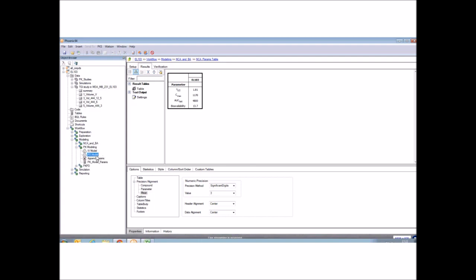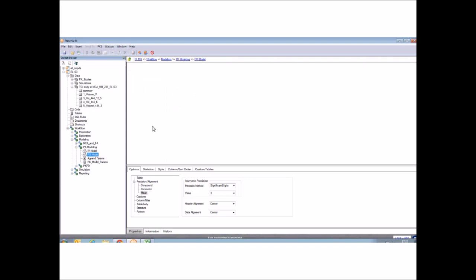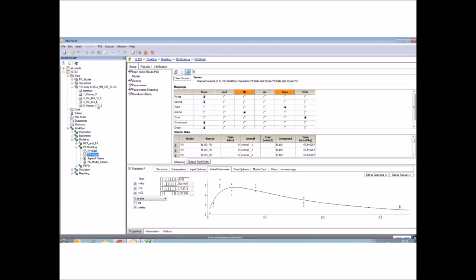We need to do some compartmental modeling, and that's because the tumor growth inhibition study data only have satellite PKs measured on the first and on the last day, so you can't derive any good estimates like Ka, volume, or clearance from those. So you need to do this from separate studies, and that's why we have this data in here. And here's the initial estimate step, which shows you the predicted curve and the observed data points in circles from the PO study.